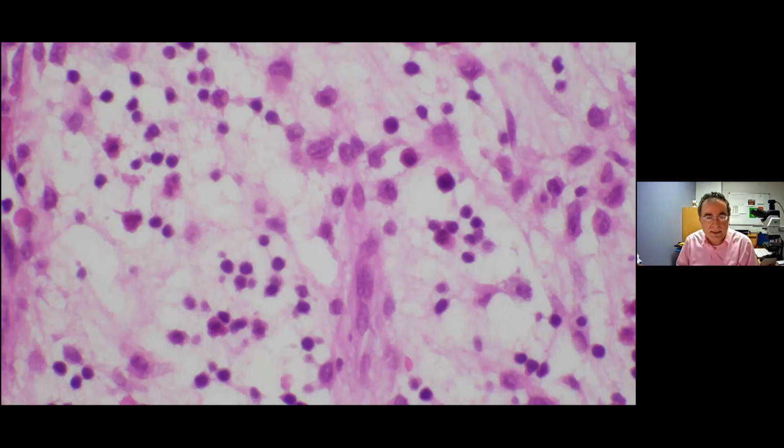So you see this nucleus has a line in the center resembling a coffee bean. So coffee bean, we use them a lot when you do a frozen section. And once we see them and we see eosinophils in the background, we're comfortable calling it eosinophilic granuloma or Langerhans cell histiocytosis. Next slide.